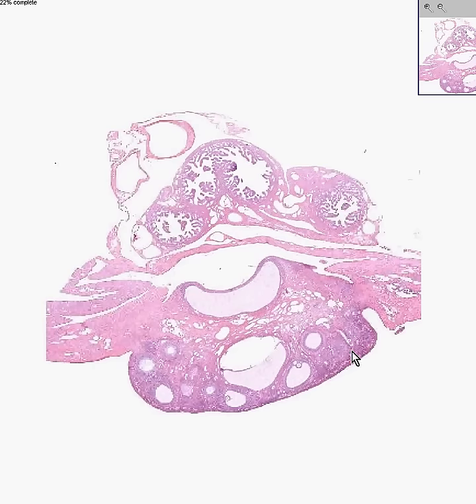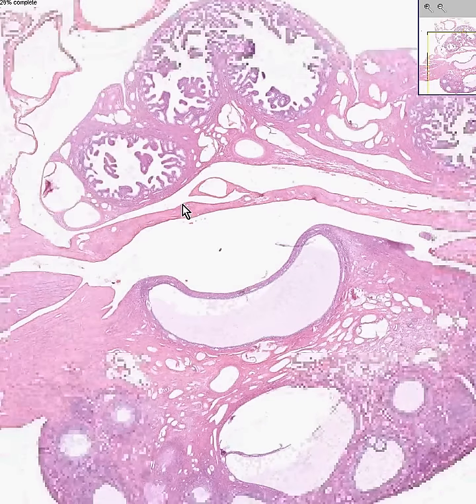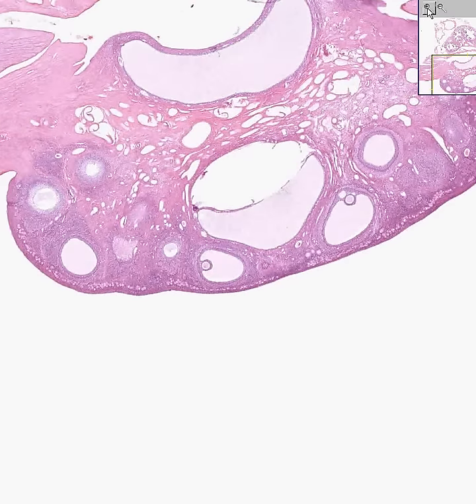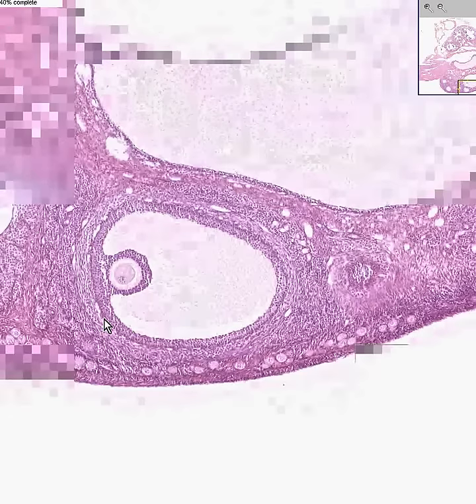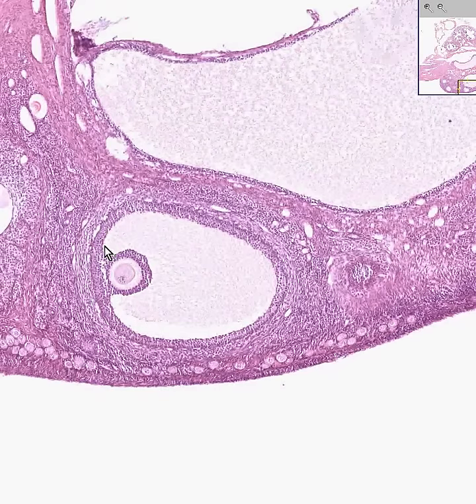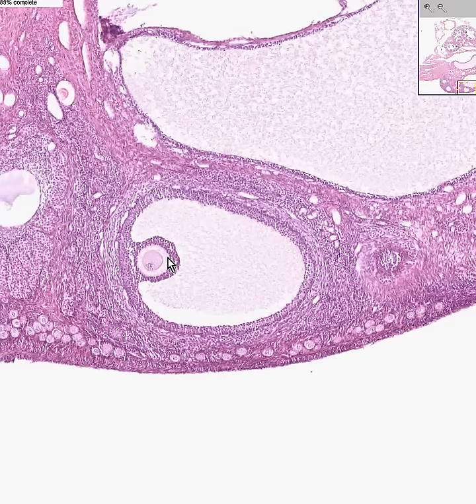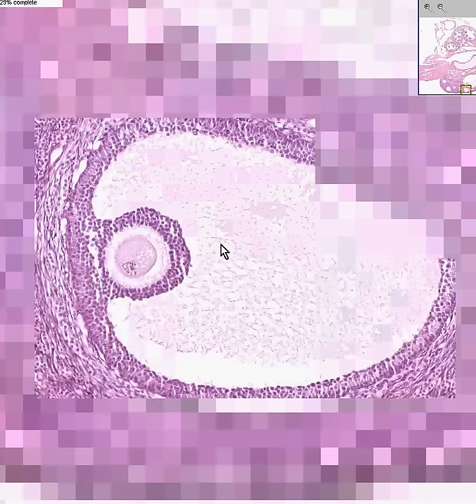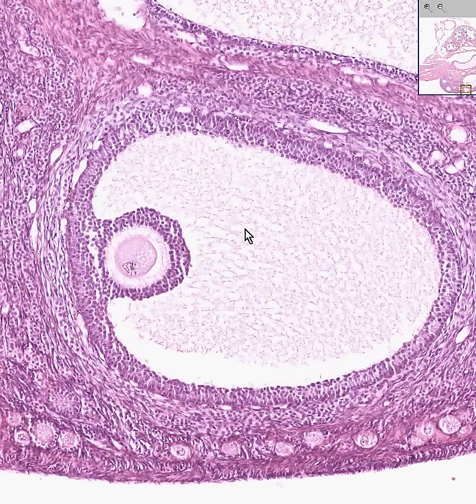Moving to another slide, and sure enough, in this particular ovary you can see granulosa cells surrounding the ovum, granulosa cells surrounding the whole follicle, and a large antrum filled with liquor folliculi — very rich in estrogen. This is now a Graafian follicle.